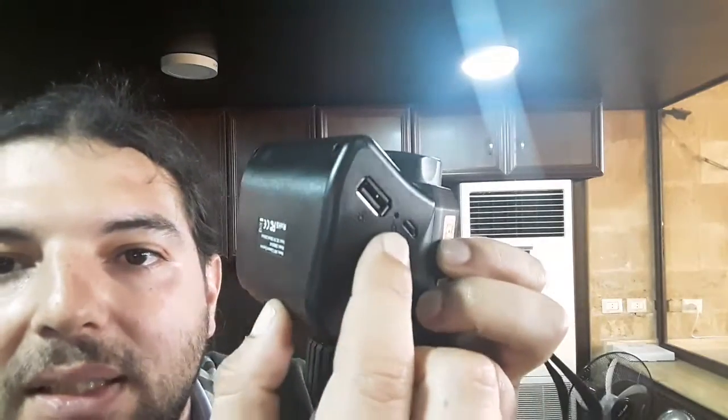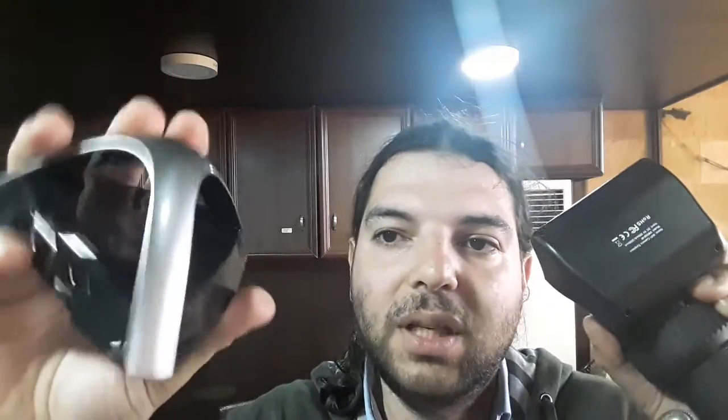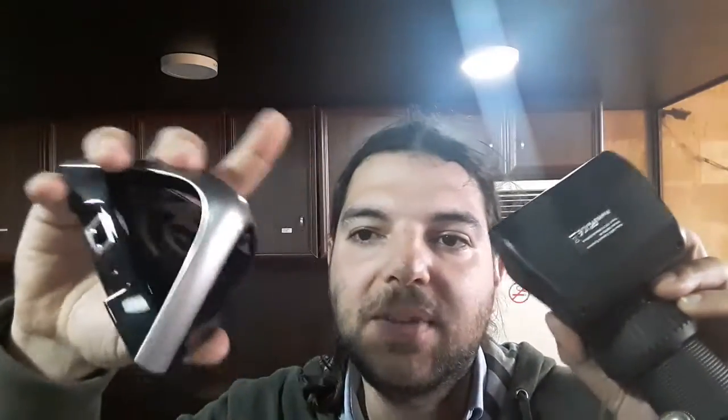There's a small hole here to reset the Wi-Fi. You can also make the Wi-Fi connect to an access point. This camera can work as an access point itself, and you can get your phones connecting to it. Alternatively, you can connect this camera to an existing access point, and then other phones and laptops can connect to the access point to view the camera.